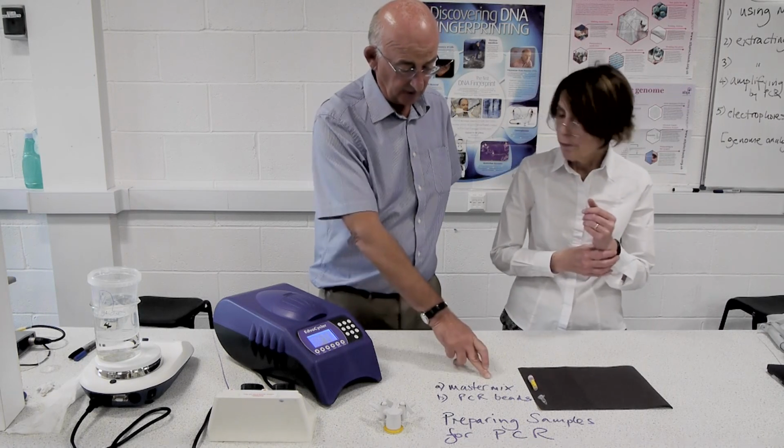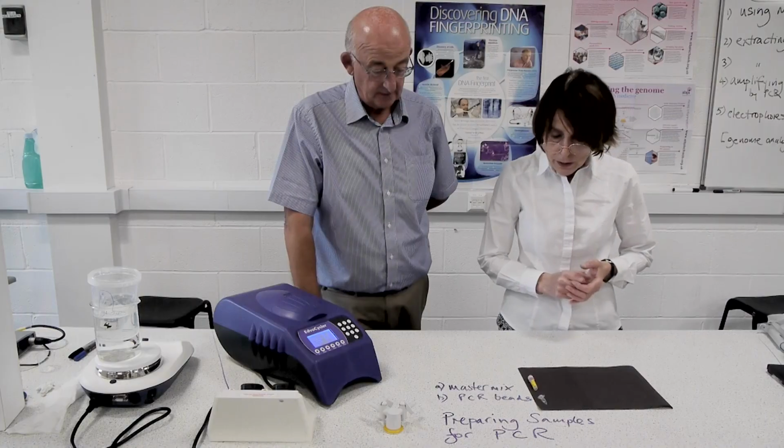Am I right in thinking that we're going to do the first one, the master mix? We're going to use master mix. Okay. And there's a reason for that. Okay, shall I explain?